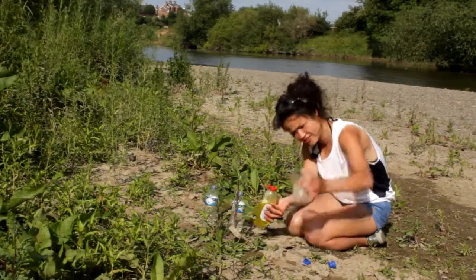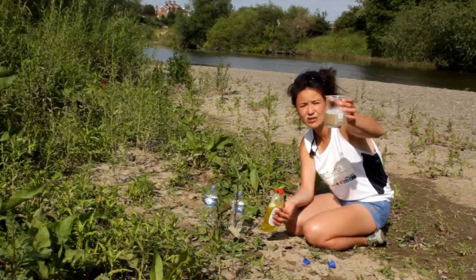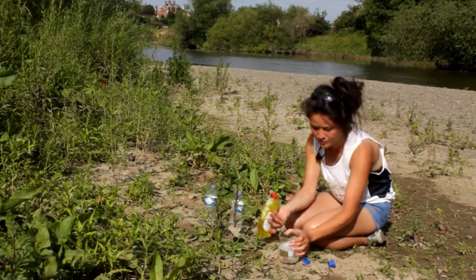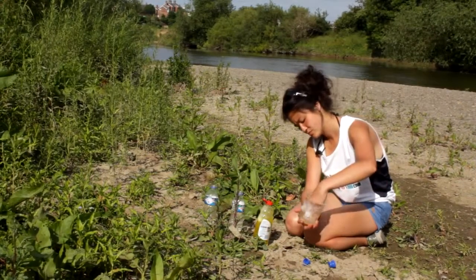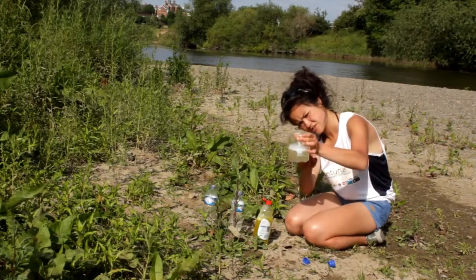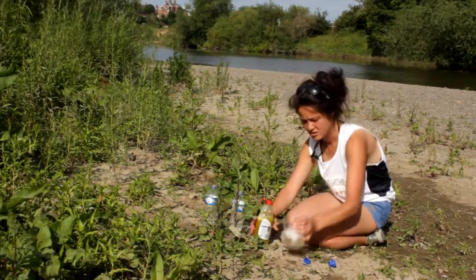So you can see we have got a layer formed there, but it's not as thick and as heavy as the first one. So maybe if I put in a little bit more. That's a 4th squirt. So you have a bit of a thicker layer there.